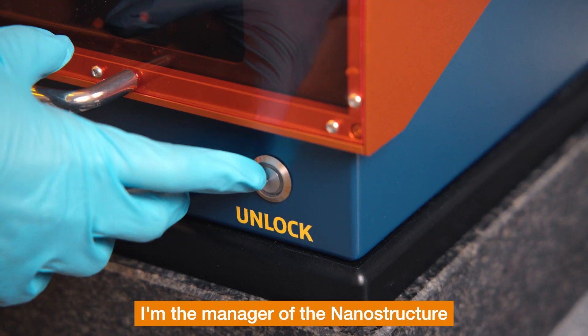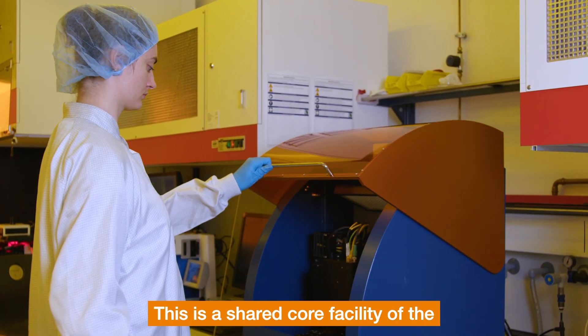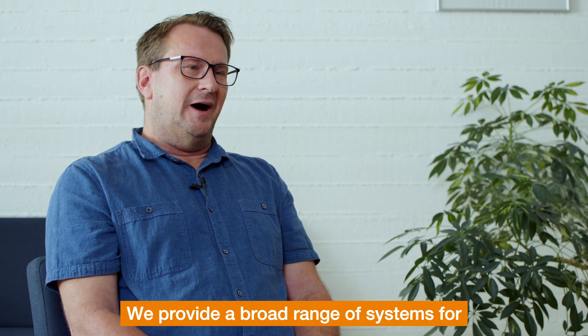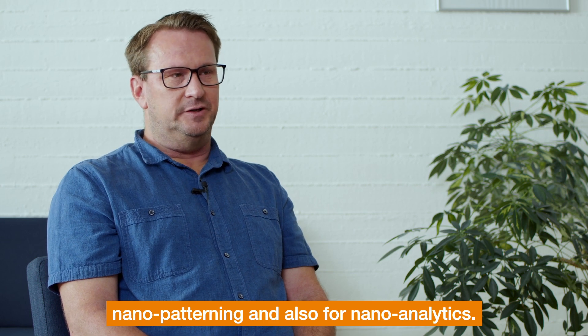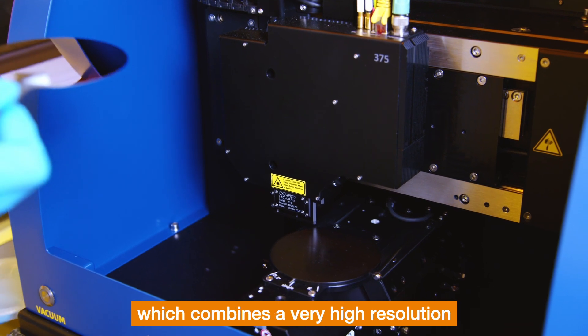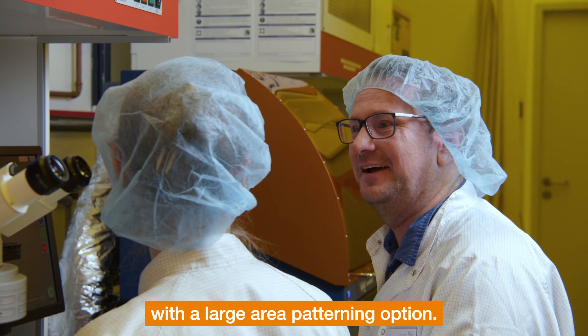I'm the manager of the nanostructure laboratory at the University of Constance. This is a shared core facility of the departments of physics and chemistry. We provide a broad range of systems for nano patterning and nano analytics, and the newest system we have is the PicoMaster, which combines very high resolution with a large area patterning option.